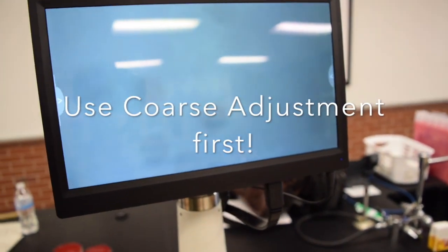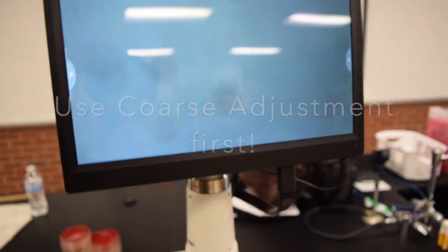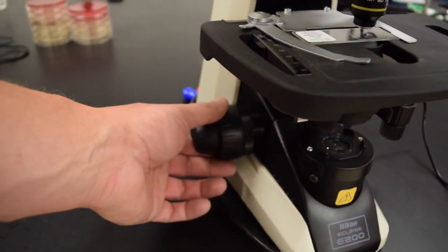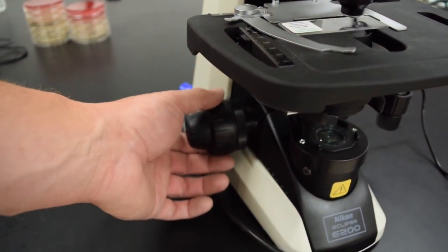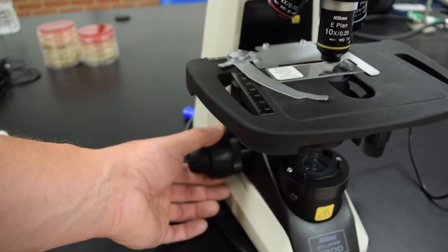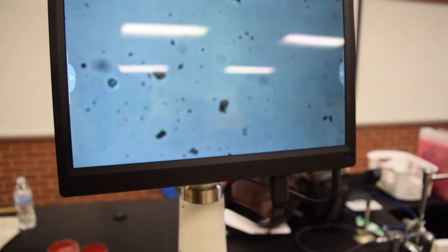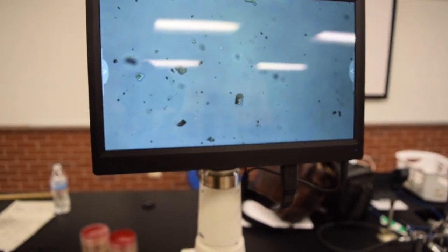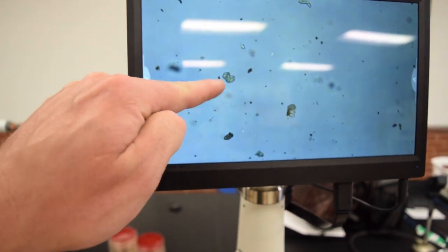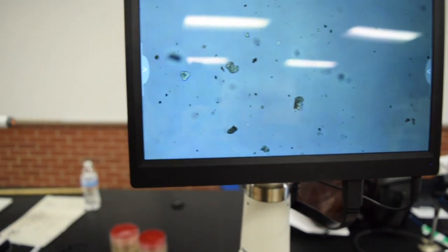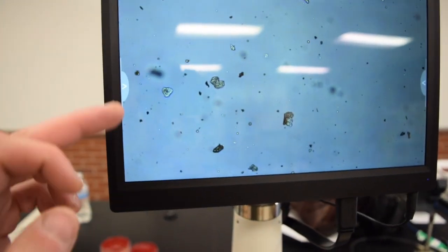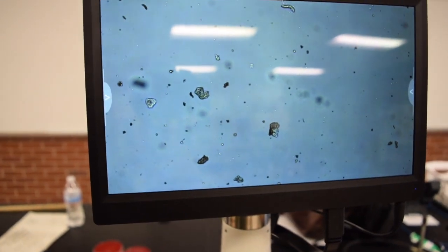The first thing I'm going to do - I'll hold this up at the camera station - is start with the coarse adjustment knob and turn it towards me so the stage moves down. You can see some gunk coming in on the screen, and notice how this is very large. This is 100 times magnified, and what this looks like is some dust on the microscope. I'm going to go past that large stuff.